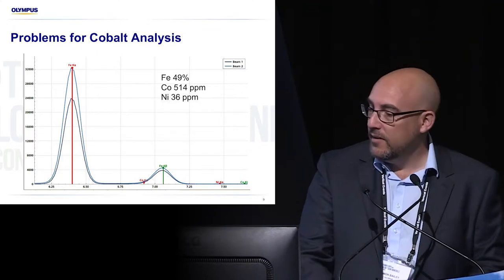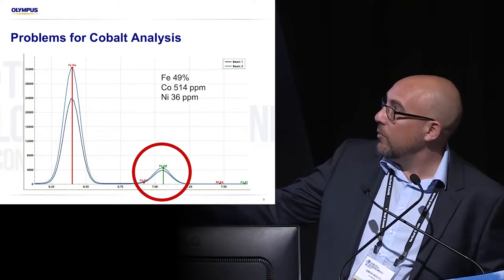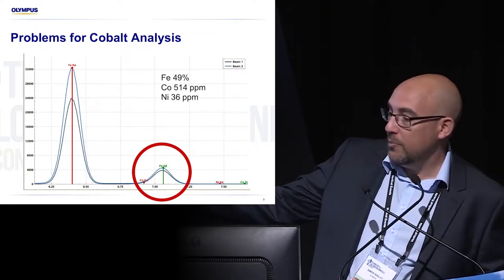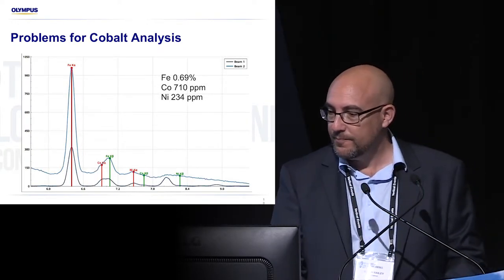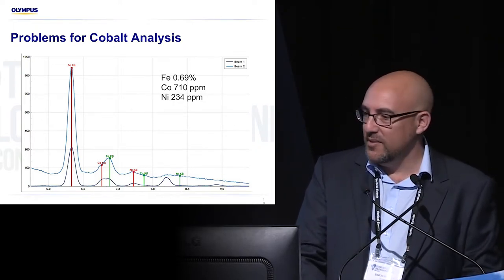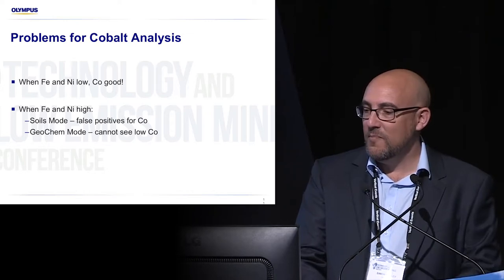You can see visually what you're looking at here: the primary peak for iron, and then you've got the primary peak for cobalt. And you see if the iron's present, the cobalt peak is swallowed up — it's hard to see for the XRF. And this is just with a little bit of iron — this is 0.69% iron. So in summary, when iron and nickel are there, the cobalt results are no good. We get false positives.